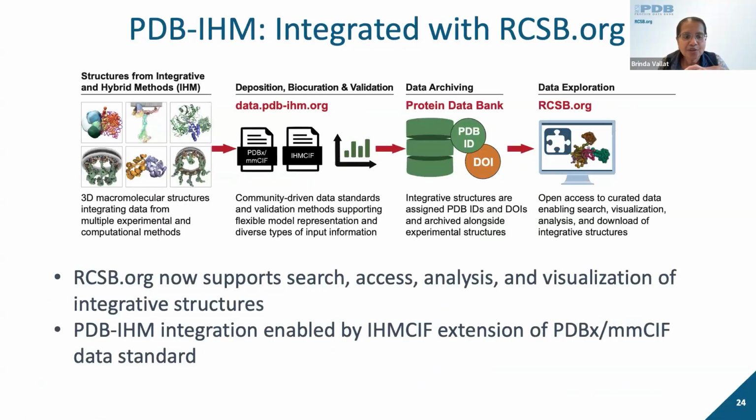So going to the most important part of the talk, which is how you can explore these structures on rcsb.org. The RCSB website supports search, access, analysis, and visualization of integrative structures, similar to what you would find for experimental structures in the PDB. Just like you can search, analyze, and visualize experimental structures, we have tools to do the same for integrative structures. And this integration was made possible primarily because the IHM CIF data standard is an extension of PDBx/mmCIF, which is used by the PDB archive.